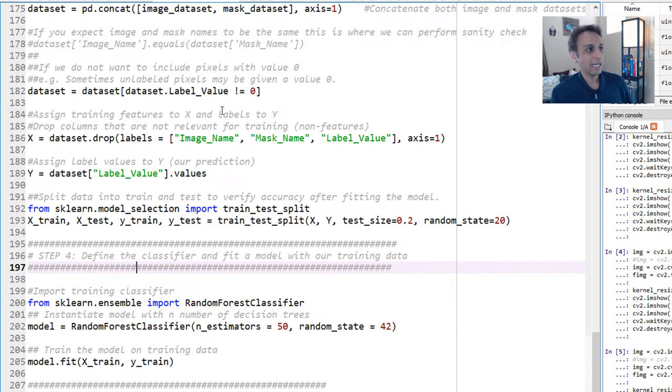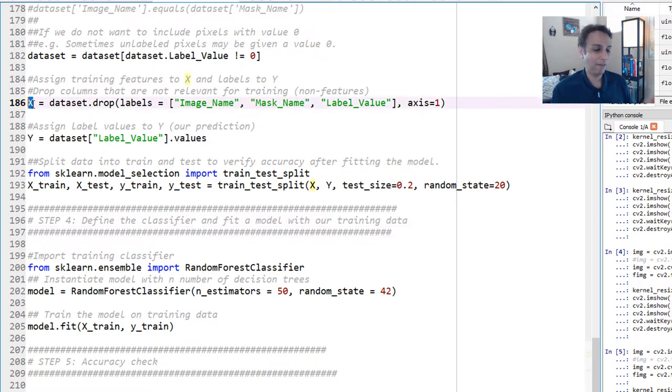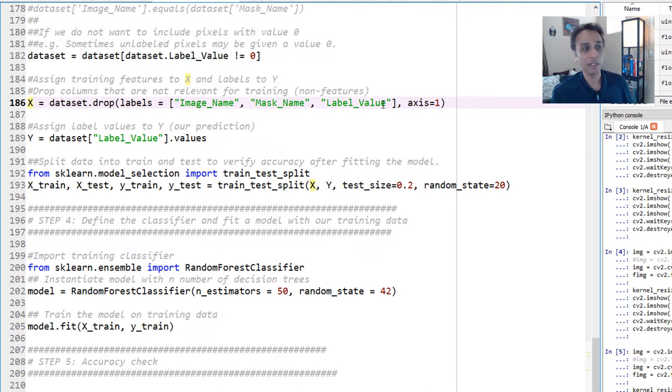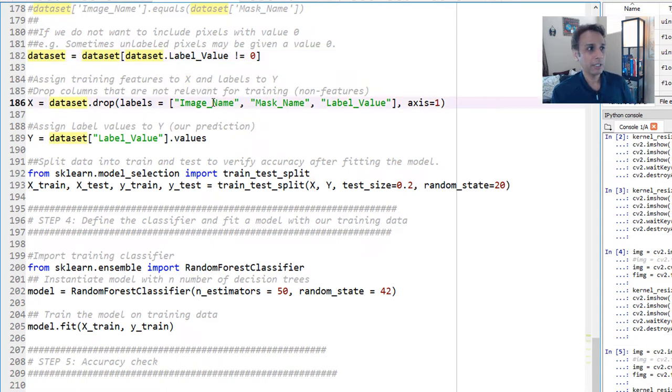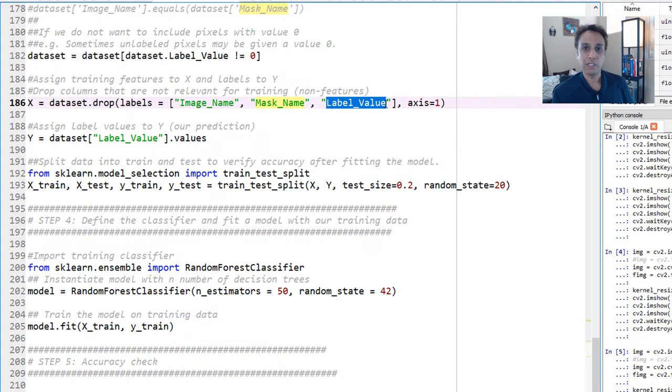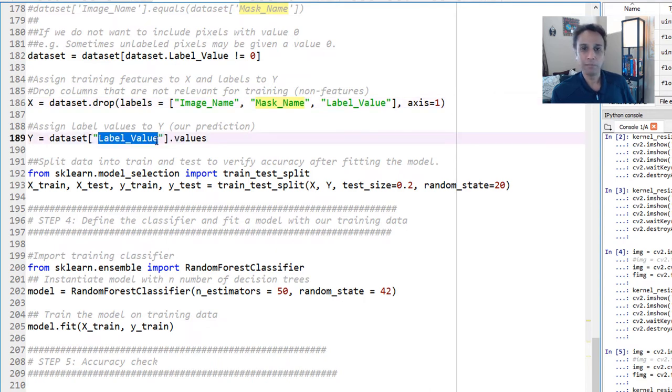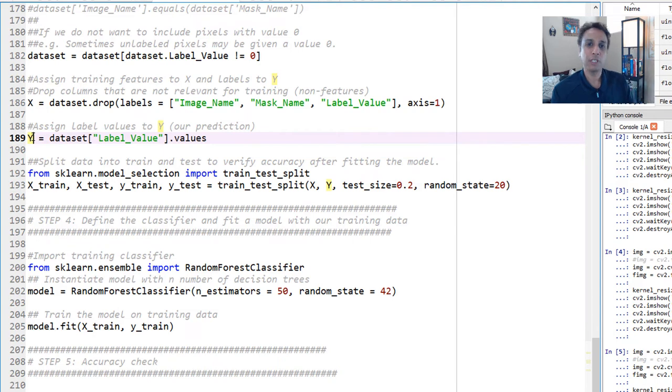And then now we are ready to define our X and Y. Remember, any machine learning algorithm, you have X and Y. X is all the features that you're training on, and Y is the prediction. Y is what you're trying to predict. So our X here is all the features, which means my entire data frame that we have created here, the entire data set, except for the ones that are not features. What are not features? The image name, mask name, are not features. Obviously, these are names. And label values are also not features. This is the prediction that we are trying to make. So drop these three along axis one, which means drop these columns, and you have your X. Your Y is very simple. Your Y is your data set with only the label values column. You just want the labels. This is what we are trying to predict. Is that pixel belonging to 0, 1, 2, 3, 4? Which one does it belong to? So that's what Y is.